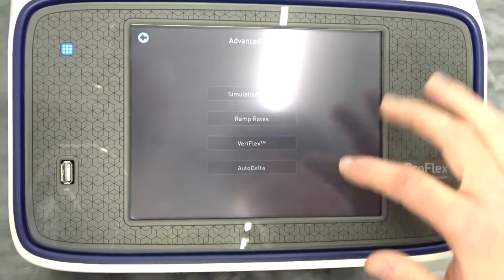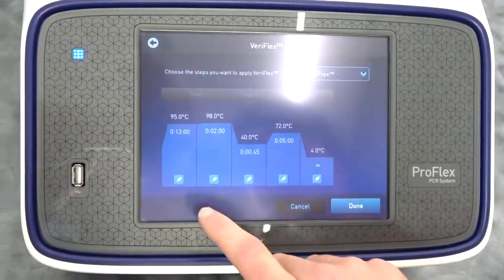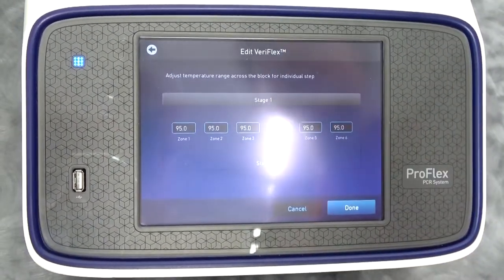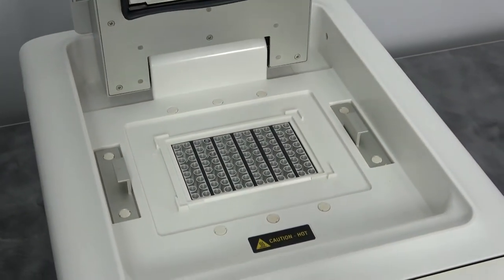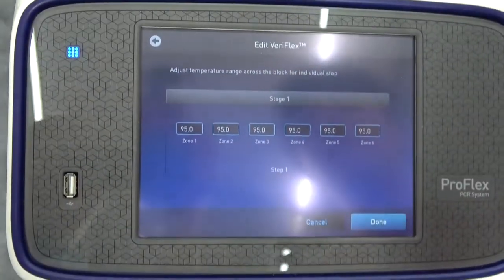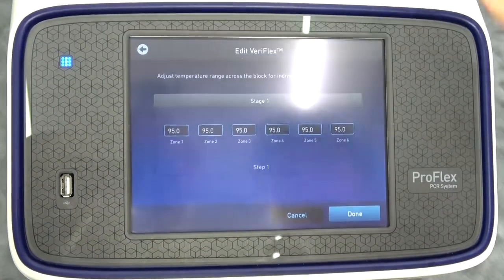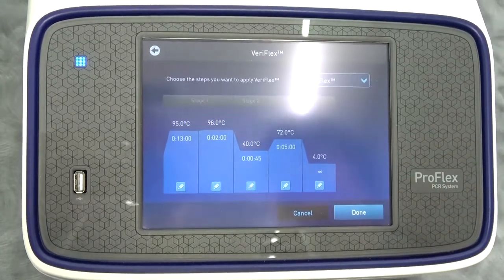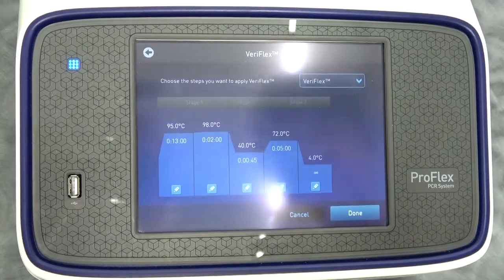Another really cool advanced option with a lot of flexibility on the ProFlex is that you can modify the individual temperatures of each block zone for each step of your run. So if you don't have a lot of samples but you want to run different reactions, you can set up multiple reactions on the same block — up to six different reactions. So if you're not a high-throughput lab but you have a lot of different things you want to experiment with, this gives you that flexibility.